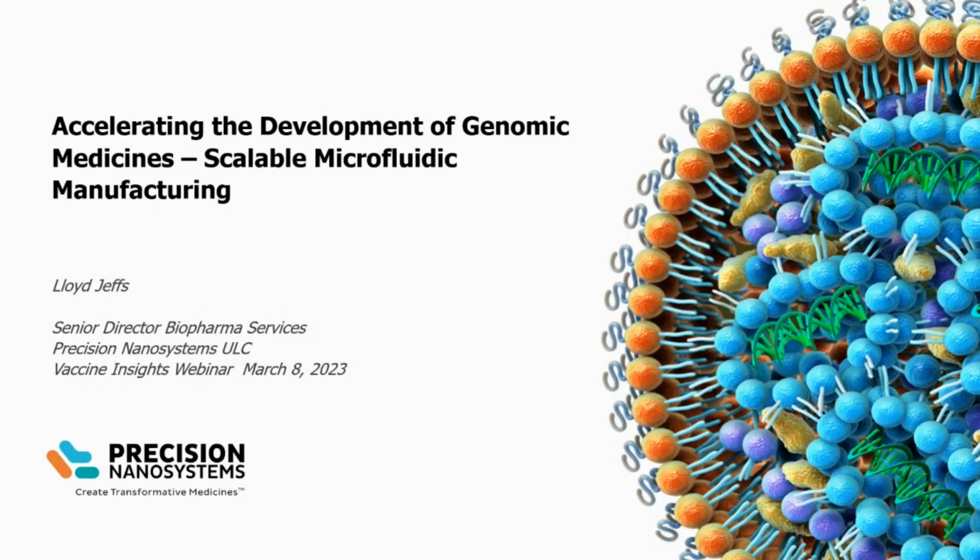I'm Lloyd Jeffs. I'm the Senior Director of Biopharma Services here at Precision Nanosystems. I want to talk about our microfluidic manufacturing and how that enables the development of genomic medicines, including vaccines. And I'll give an example of a self-amplifying RNA-LNP vaccine that we have developed with the support from the Canadian government.